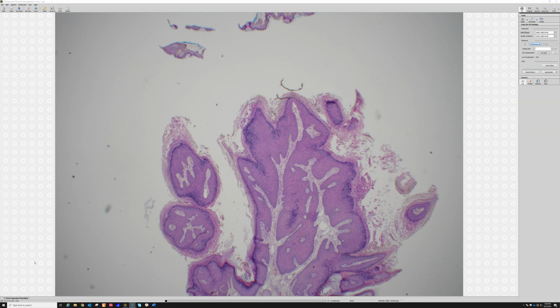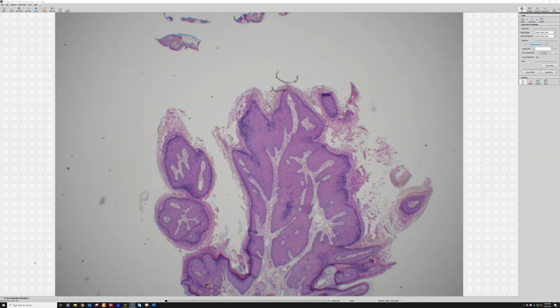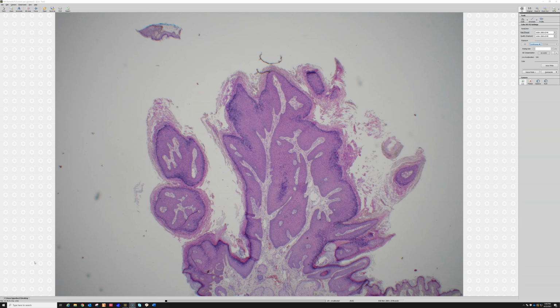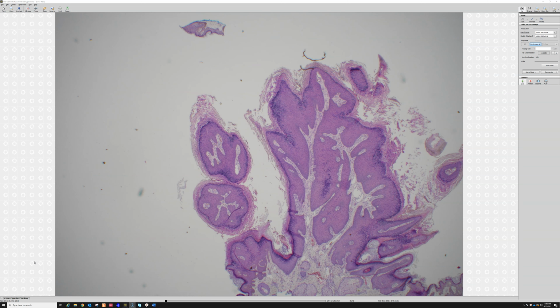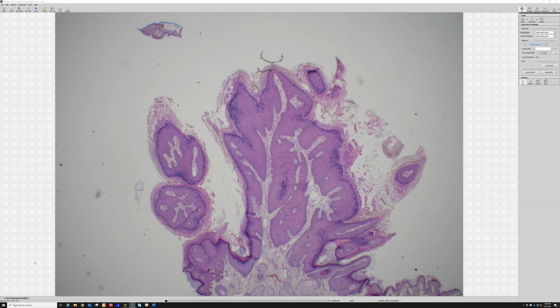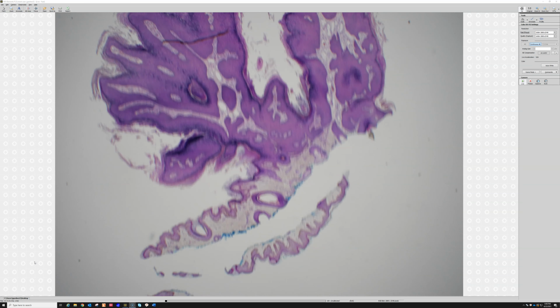And when they have a lot of thin, elongated, thread-like papillae, you can call them a filiform wart if you want to get fancy, or you can just call it Verruca. I'll say Verruca, filiform type, just for fun, but it honestly doesn't matter at all clinically. It's still Verruca, that's all that matters. But this particular example is a good example of how pedunculated and polypoid warts can sometimes be.